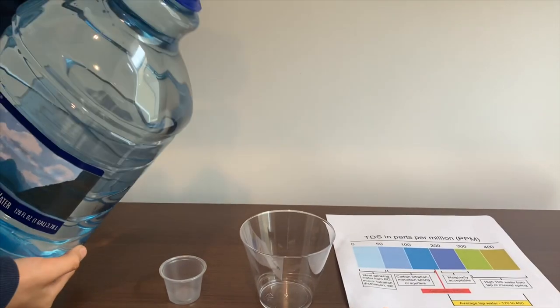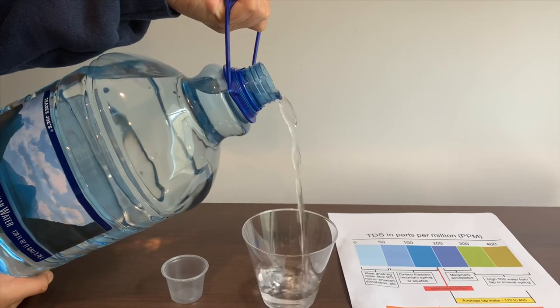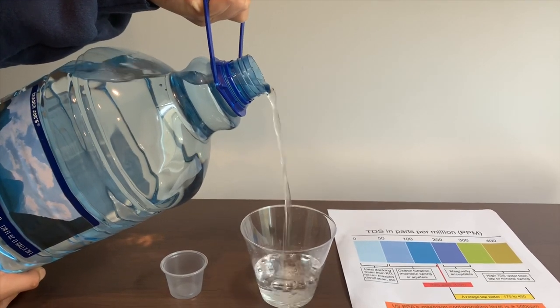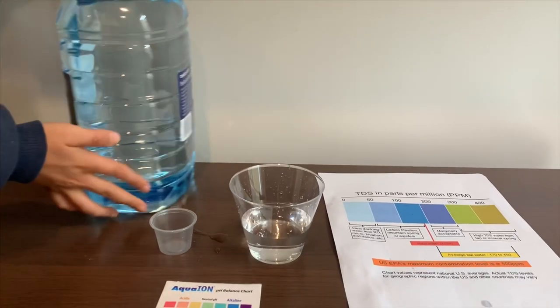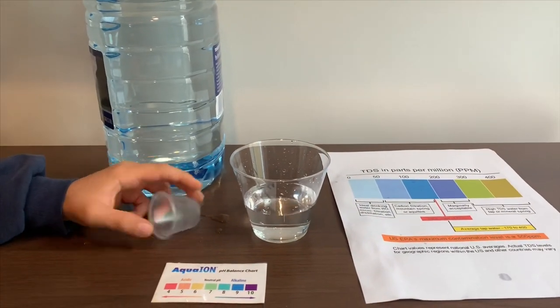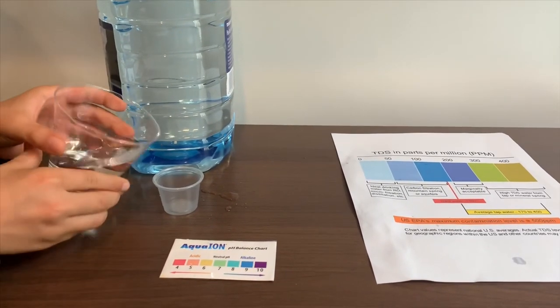Let's pour some water in. Since this is too big to pour inside this cup, I'm going to use this cup to pour inside the small one.